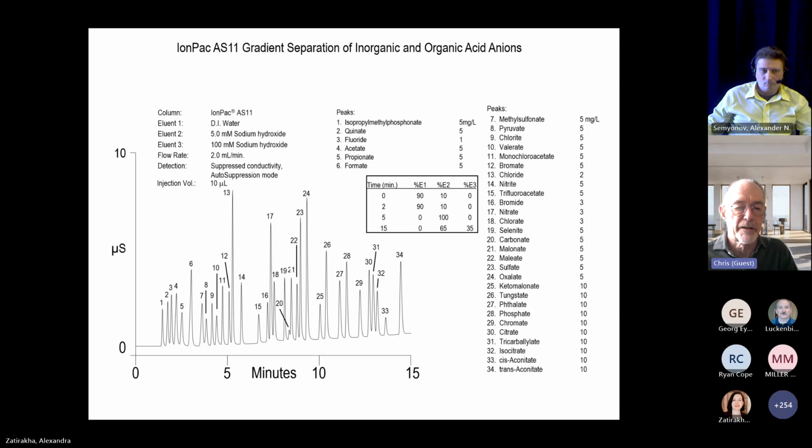And with an epoxy monomer, the monomer itself adds 1 beta hydroxy group. So if you combine methyl diethanolamine with an epoxy group, you'll get 3 beta hydroxy groups as a product. So this was our first column that had 3 beta hydroxy groups.